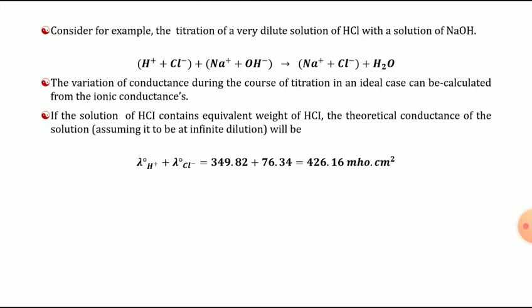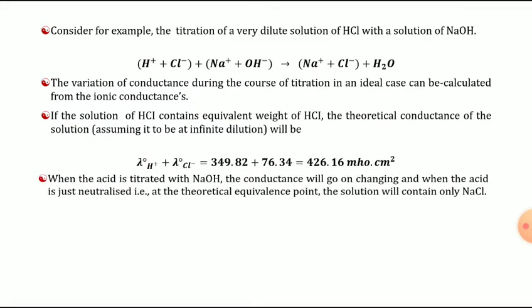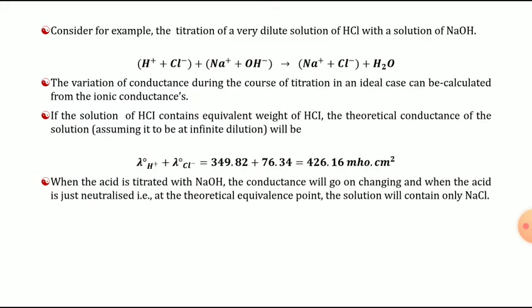Now similarly we can see for Na+ and OH- also. When the acid is titrated with NaOH, the conductance will go on changing. Why changing? Because the H+ and Cl- ions go on decreasing. When the acid is just neutralized, that is at the theoretical point, the solution will contain only NaCl.